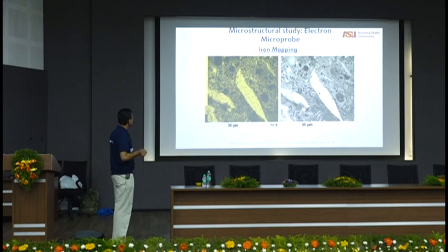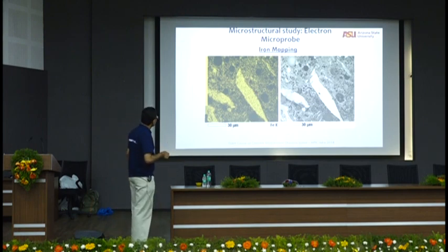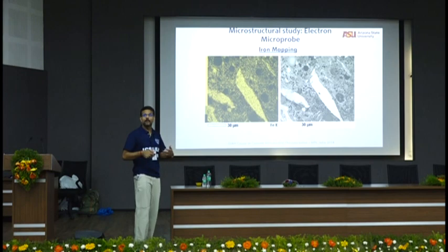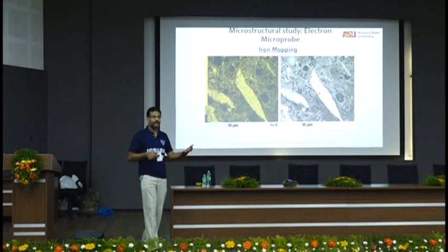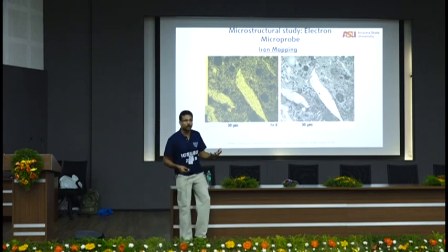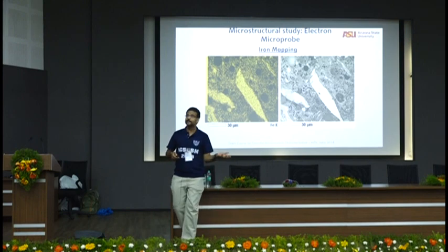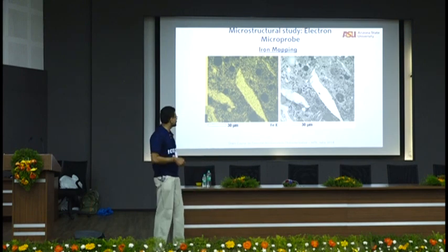You don't see it in the holes, but what it tells you is, if you put in just an iron particle, and we have put in some mild acids also in the system to make the iron more bonding to the surfaces, you can see that iron has diffused from these particles all through the microstructure. So I want to know what is the distribution of iron. I want to know if the particle that I'm putting in is spreading all around. For example, if you put in fly ash alone, and you want to know if silica in geopolymers, for example, if silica from fly ash is spreading around and going all over, you can look at this and see if the silica is spread through or if silica is localized in one place. That also helps you find out the degree of reaction, right? How much reaction has happened.